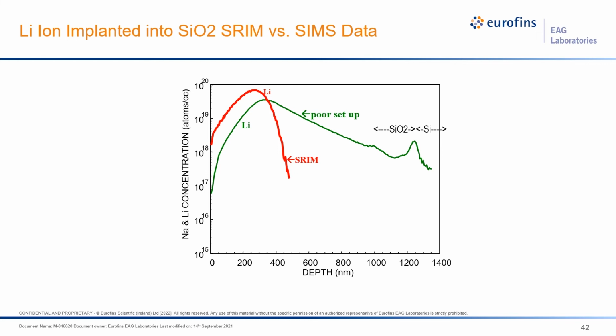But with a little elbow grease and blood on the floor, you can actually get a SIMS profile that gives you a profile shape that is meaningful and what you would expect. So it is possible with little effort put in.